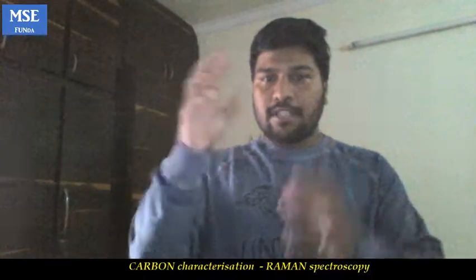For example, given a carbon material, and I would say there are many types of carbon materials, that is, the carbon can exist in different forms, and these are called allotropic forms of carbon. Just based on the spatial 2D or 3D orientational changes of carbon, the alignment of the carbon with respect to one another. Based on these arrangements of carbon in the system, the properties of the material itself vary.